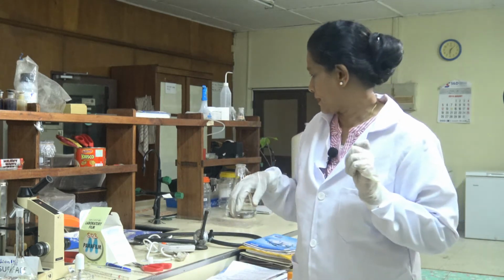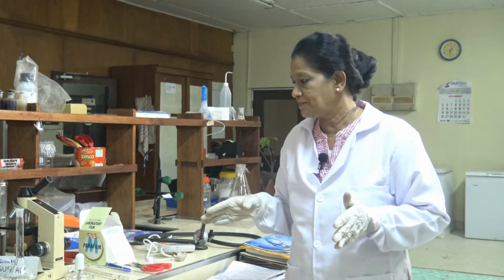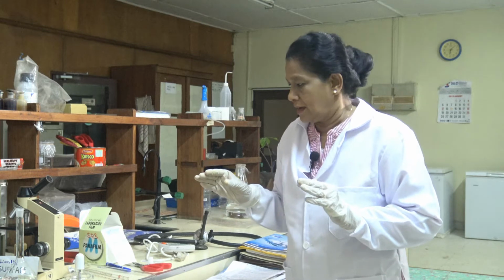And also, proper housekeeping is essential, and good mindfulness during the work period is necessary. So those are the basic materials we use in our laboratories, and now I will explain how to use chemicals in a safe way.